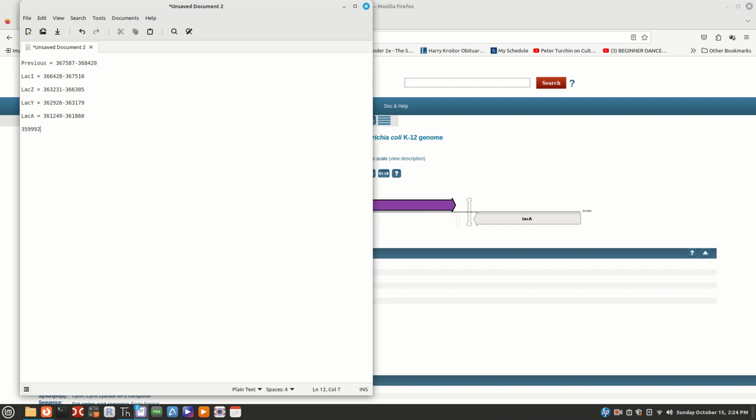359992. All right, and that goes to 361146. 361146. So 361146. All right, and I'll just call it next. So we need to kind of put these numbers together and find out the region from beginning to end that we want to grab.